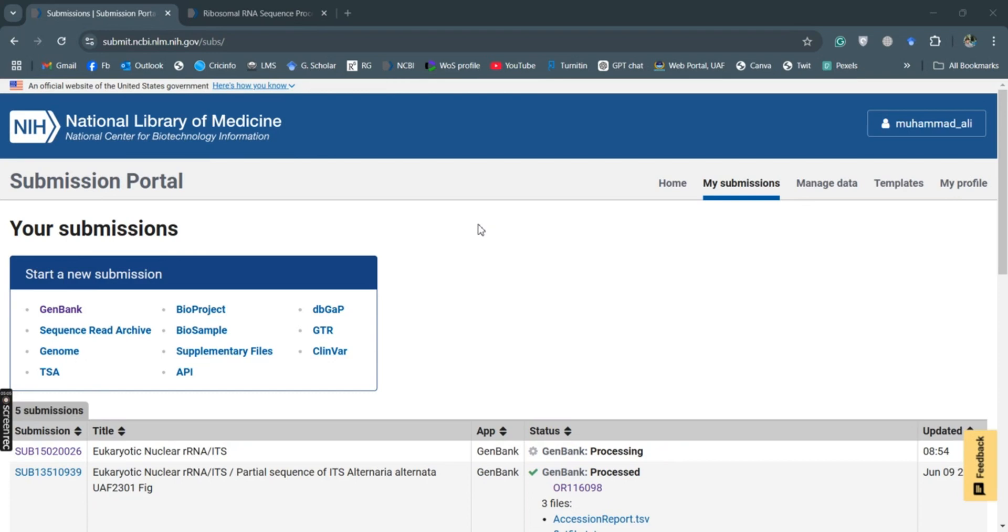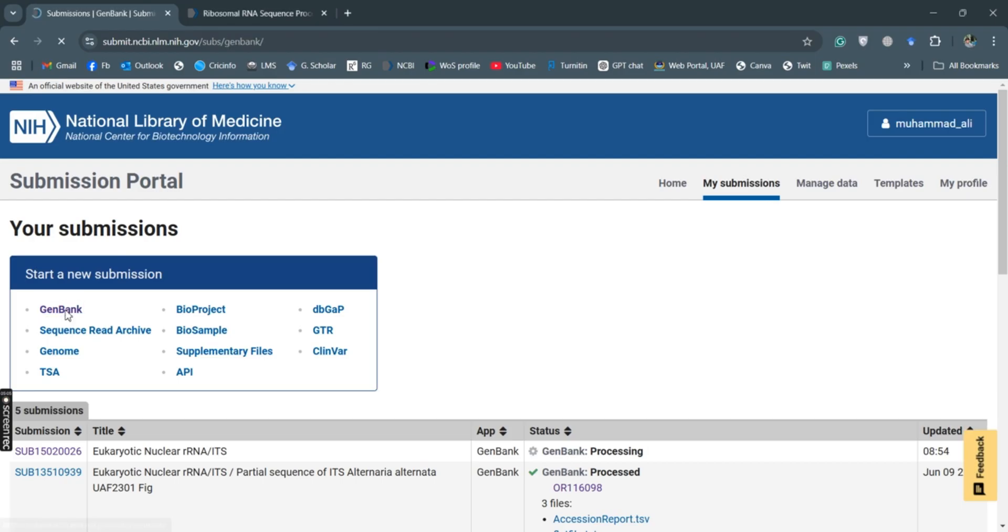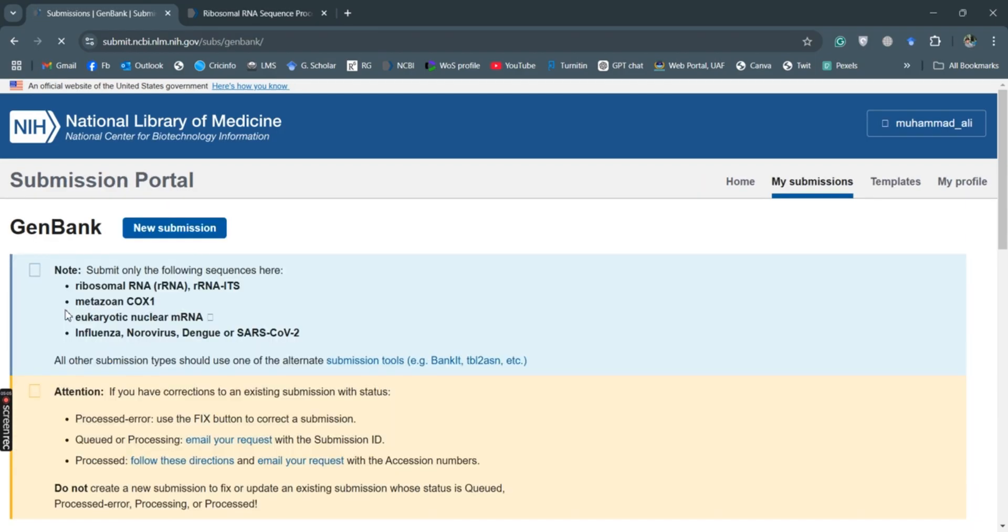Okay guys, in this video we'll talk about how we can submit the COX1 sequence to the NCBI GenBank. So first we need to sign in here. I have signed in already, and then we'll submit DNA sequences, multiple sequences on GenBank. Click on GenBank and then we'll proceed for the new submission.